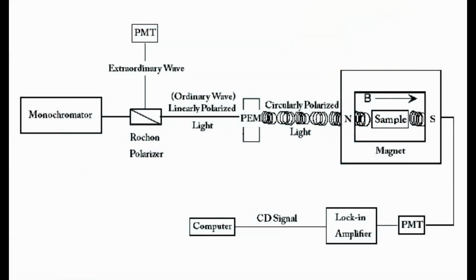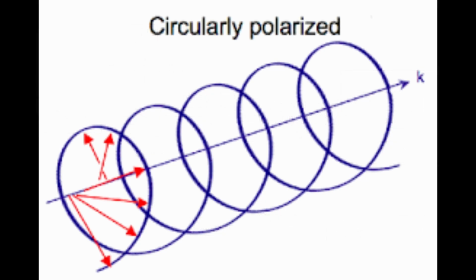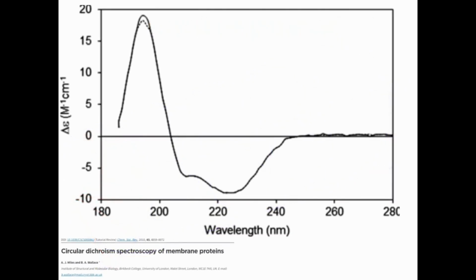Circular dichroism. Circular dichroism is a spectroscopic technique for structural characterization of proteins. The differential protein absorption of the left and right-handed circularly polarized light gives information about their secondary structure. The protein secondary structure is determined by the absorbance of the peptide bonds in the ultraviolet wavelength.